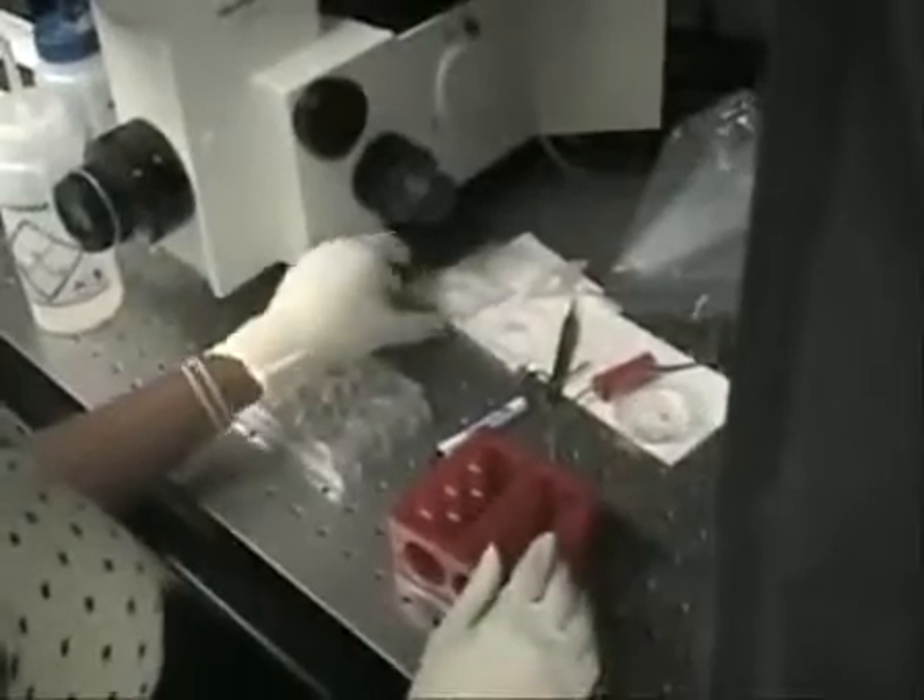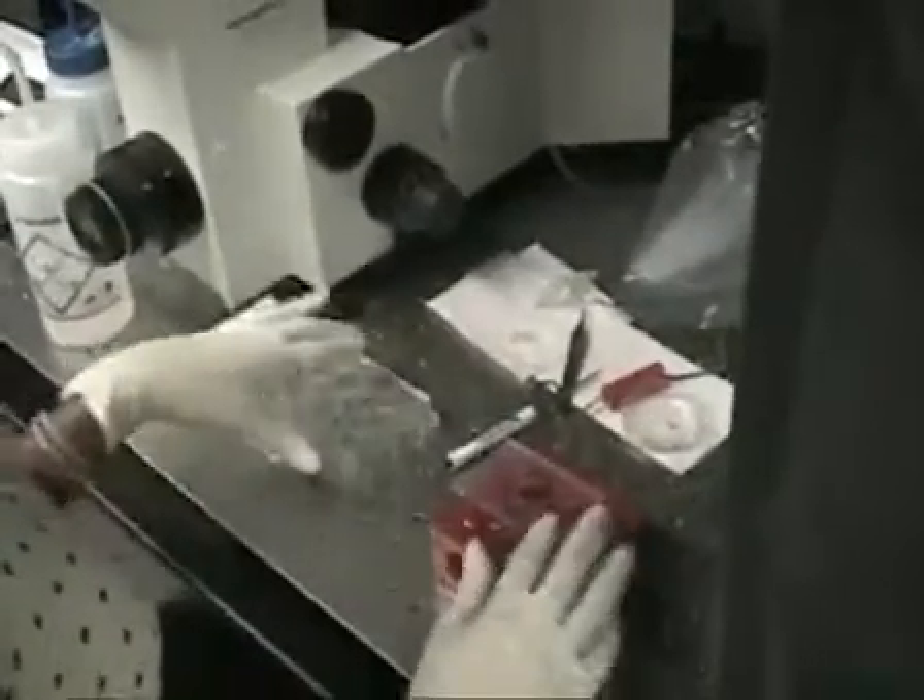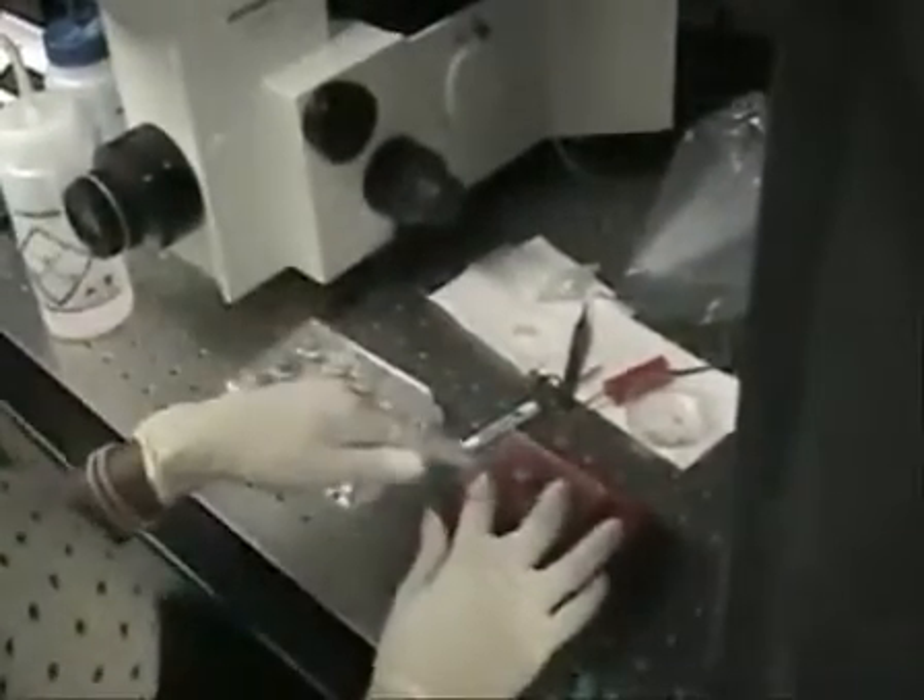Now we're going to go ahead and mount the cover slip that has neurons on it into this custom-made chamber.